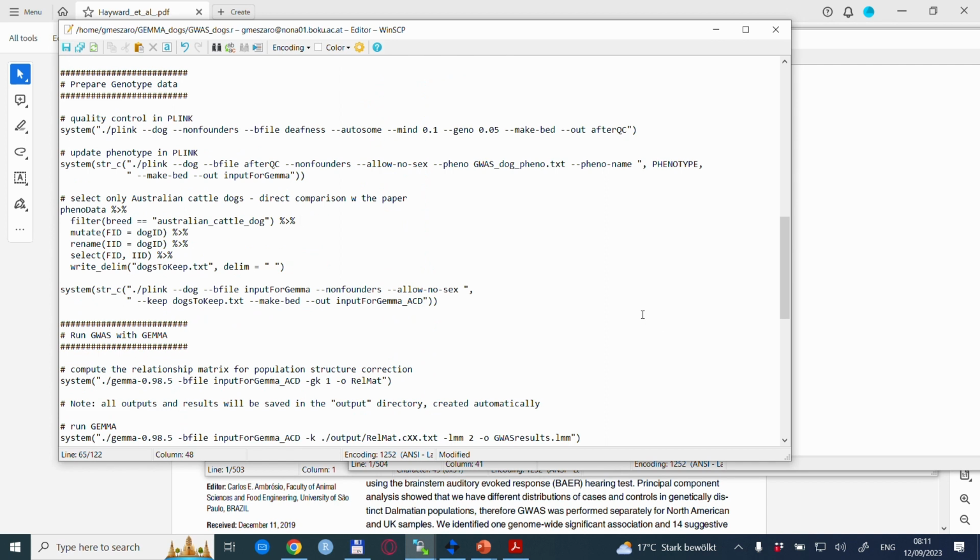The advantage of this method is that, with a little bit of tweaking, you can do loops basically with GWAS runs. So you can run many GWAS runs for each column of your phenotype file. But well, let's leave that to another day. So this time we will do a single GWAS run. So to summarize this part, with the --pheno and the --pheno-name, we update the Plink file. So now we have our phenotype column filled.